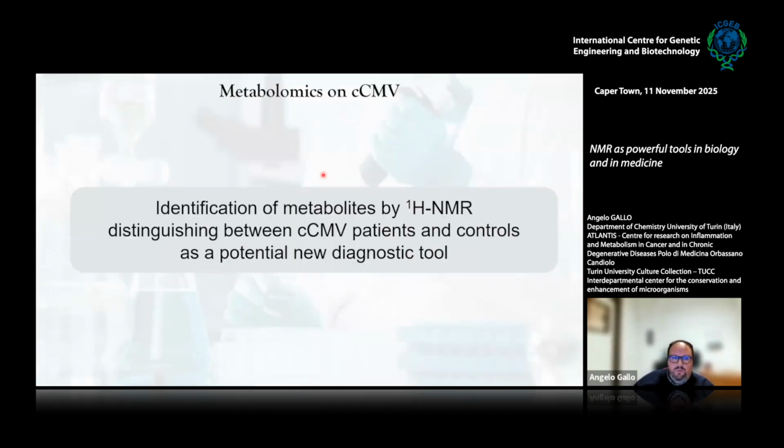So in conclusion, even though we were aware that a larger patient cohort is needed, and we need to further validate this study, it indicates that genetic variability and in vitro phenotype might play a key role in influencing the clinical outcome of the congenital infection. Additionally, I want to emphasize that there is a metabolomic fingerprinting of the congenital infection, and the study at this stage is going to get expanded soon into a multi-center study where the University of Varese, University of Naples and Rome will contribute with more samples.